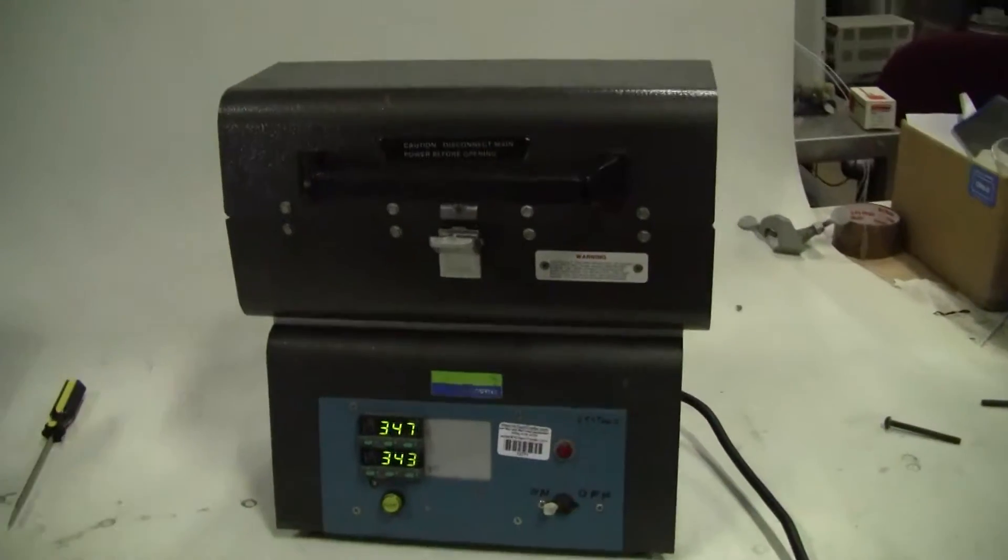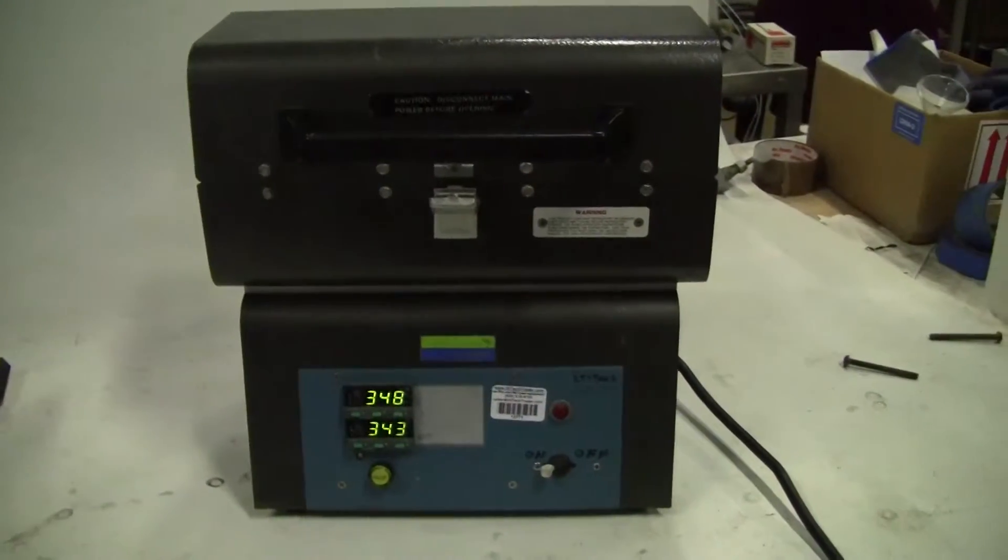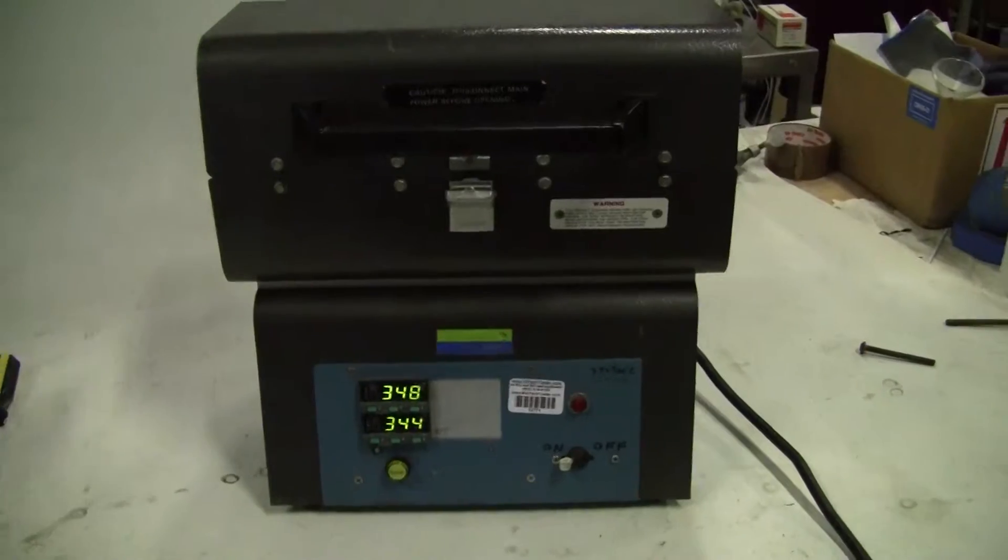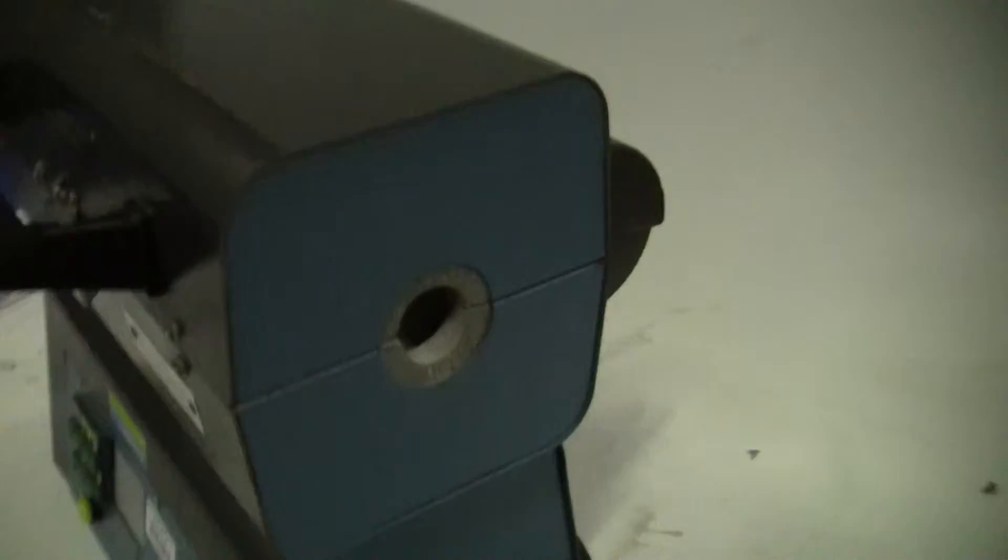Hi, this is Michael from Hi-Tech Trader. Today we have a Blue M Mini-Mite. It is a one-inch tube furnace, clamshell.